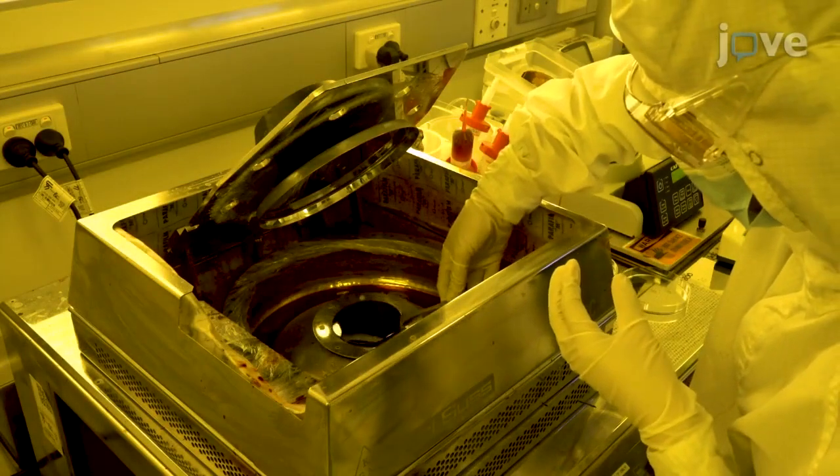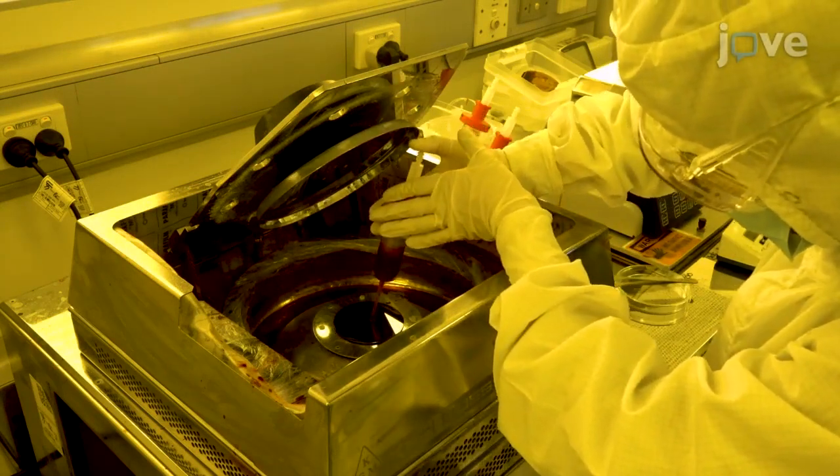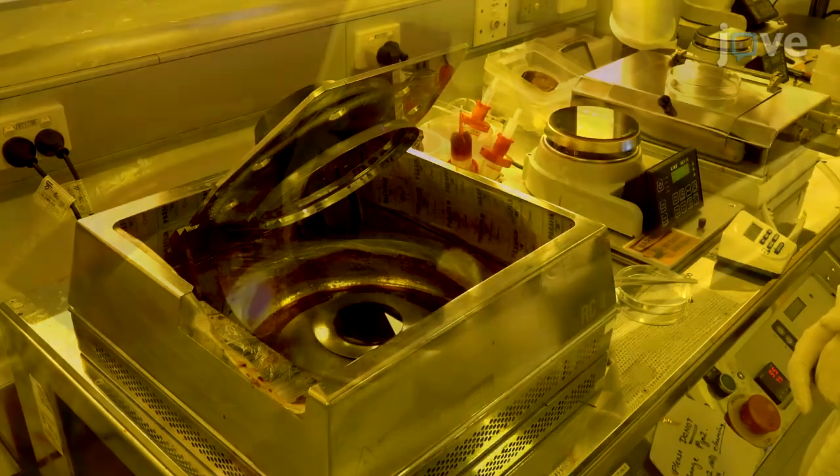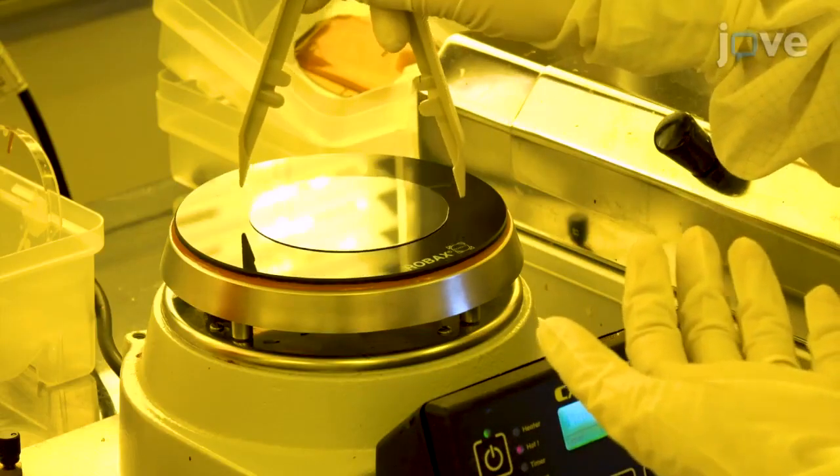To pattern the bottom electrode of the cross-point device with photoresist, first spin coat the photoresist onto the wafer at 3000 revolutions per minute before soft baking at 95 degrees Celsius for 60 seconds.